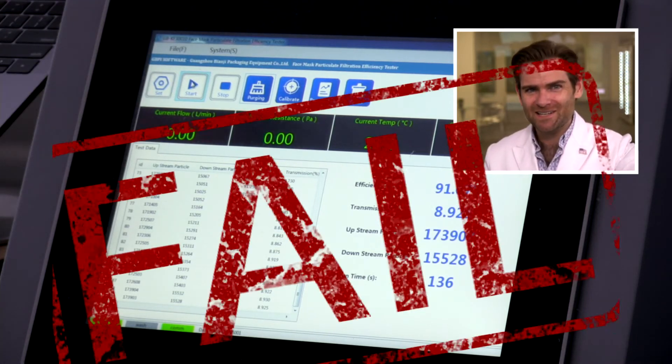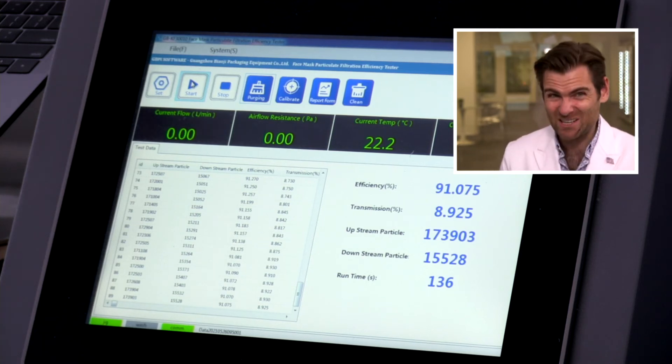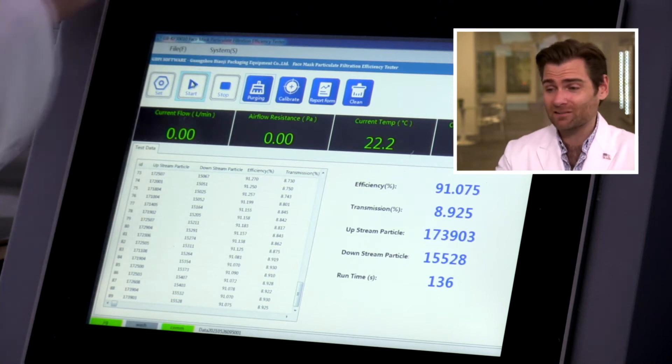91.075% — that is not great. We actually tested this earlier before, so I didn't know what this was going to be, and we tested two other ones too because we wanted to give them a fair shake. It could be a bad batch or a bad box, but this is nowhere near their claim. There is no way that Nelson Labs report they showed us is accurate.